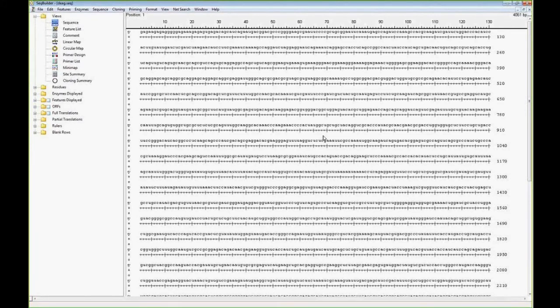To start, we first need to highlight the nucleotide string that you would like to clone with the cloning interface. The software will automatically amplify the insert with the appropriate overhang suitable for the cloning technology that you specify. To select a nucleotide, one can simply highlight a region of interest. This would be suitable if you're working with a FASTA file and all you have is basically sequence coordinates.